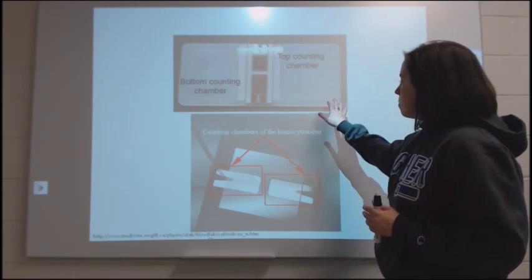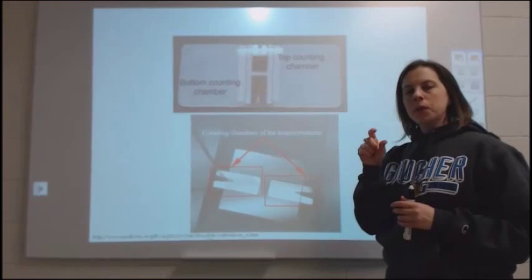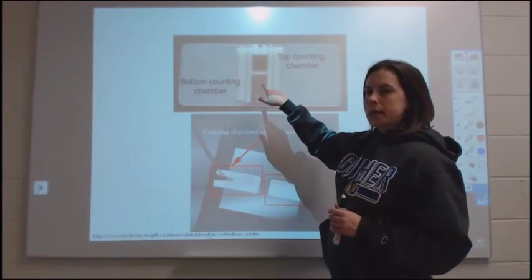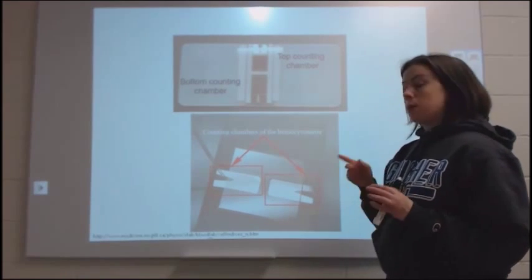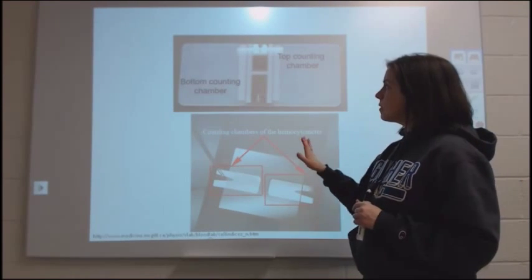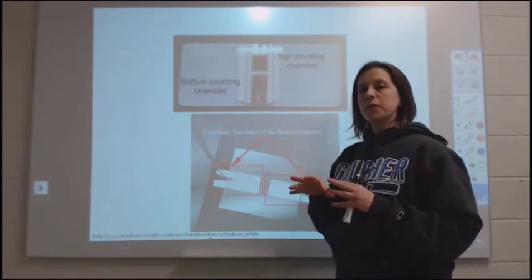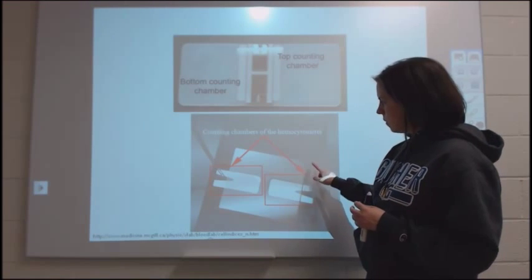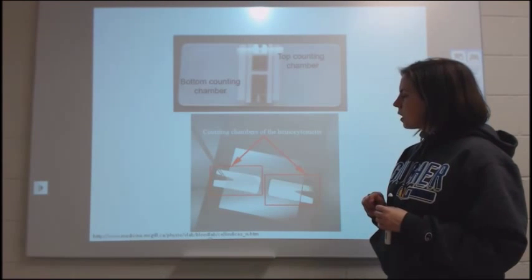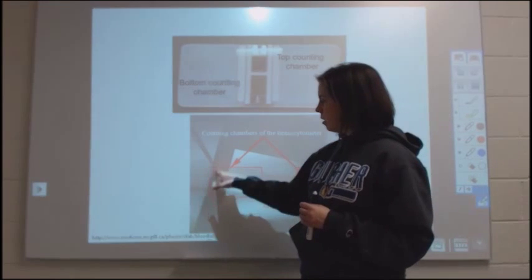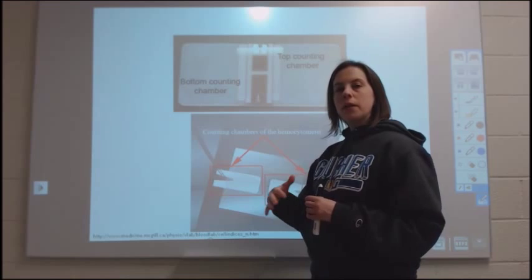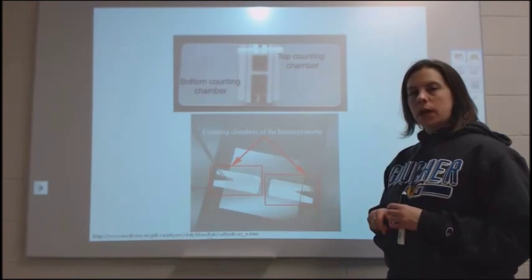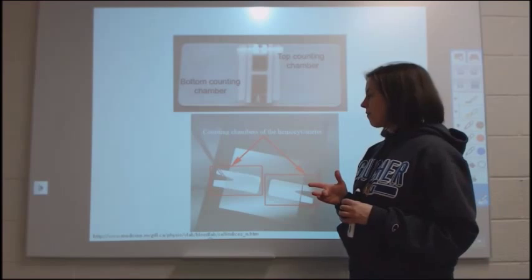So here we have the base of the slide which is a thick heavy glass, and in the center there are two metal plates, and each of these plates has a grid on that plate that you can see when you look at this slide under the microscope. Hemocytometers have specialized cover slips with a specific size and weight in order to count cells reliably over several samples. To load your cell suspension, you add a small volume in this indent and then capillary action pulls that cell suspension over the grid. You can load both sides at the same time and then you can do multiple counts on your cell suspension and take an average for better results.